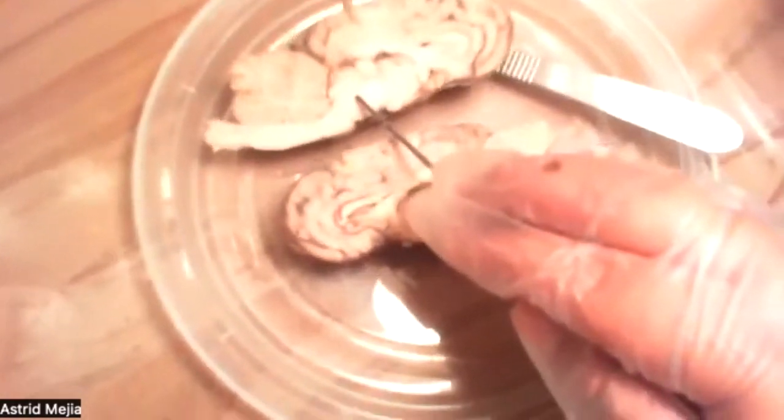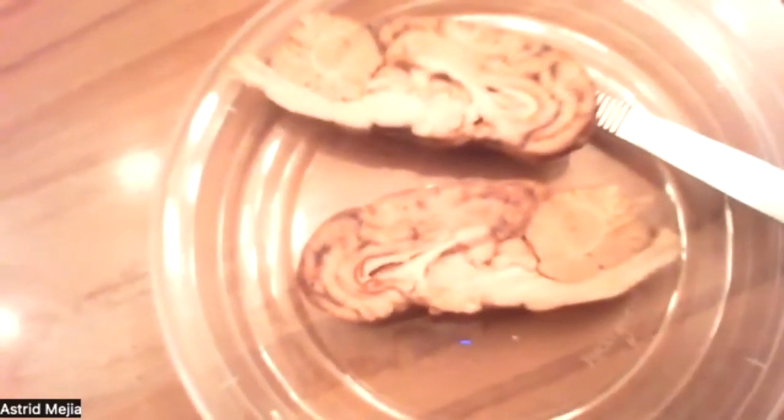And then the midbrain will be right here. Okay, so the midbrain would be right there. And the midbrain processes visual and auditory signals. So it'll basically be right here, and then right there.